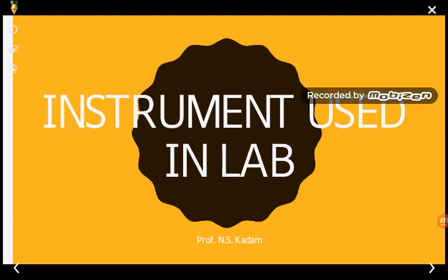So today we are going to study a few microbiology related experiments. This experiment is the study of instruments and equipment used in the microbiology laboratory. I have already sent you a few videos related to the different types of equipment which are used in the laboratory in order to perform microbiology related experiments.